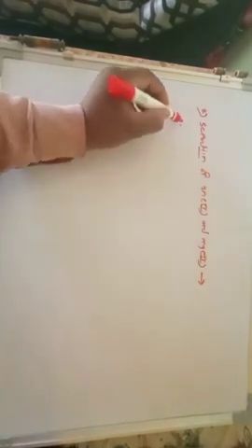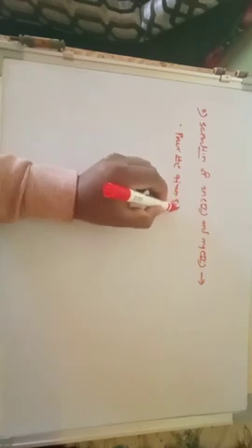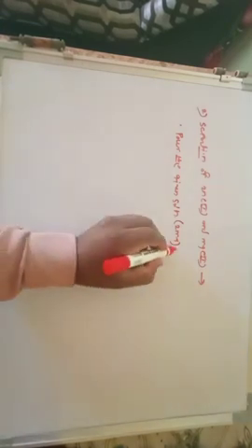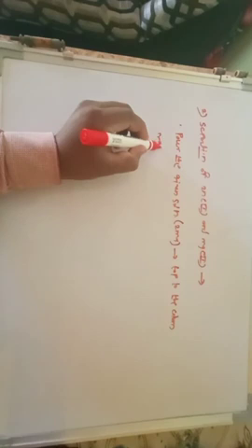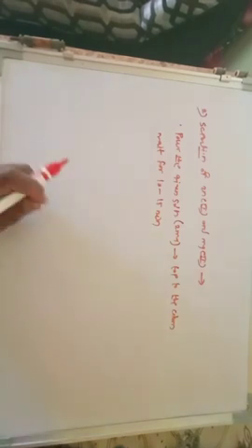So the first step is what? Pour the given solution, which means the mixture of these cations, about 2 ml containing zinc and magnesium, onto the top of the column and wait for 10 to 15 minutes. So you have to pour the mixture of these cations, zinc(II) and magnesium(II), onto the top of the column and wait for 10 to 15 minutes.